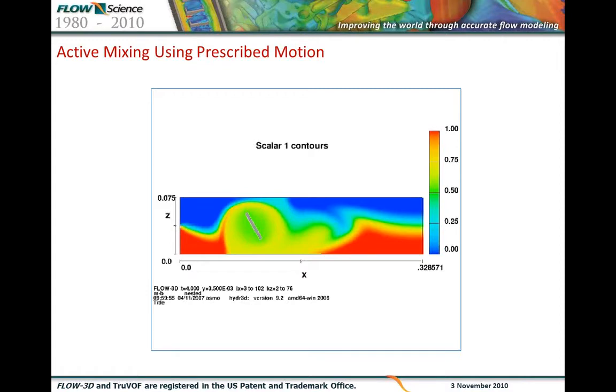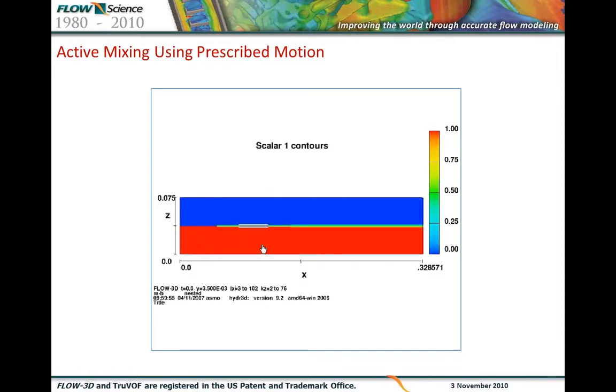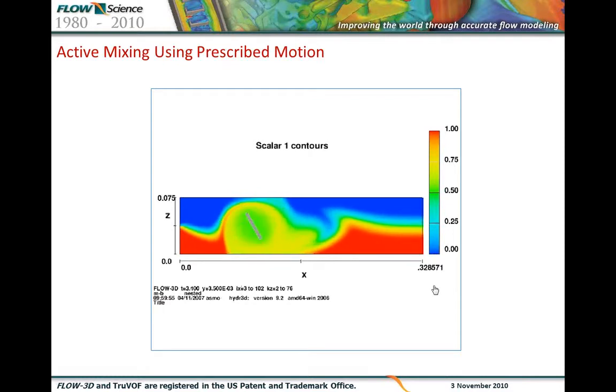However, Flow-3D can simulate multiple density components as miscible or immiscible fluids. The separation of the immiscible fluids in Flow-3D can be based on drift relationships. The prescribed motion can be time dependent. We can have angular velocity based on time.